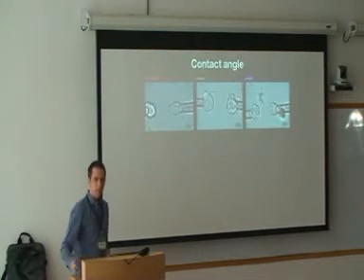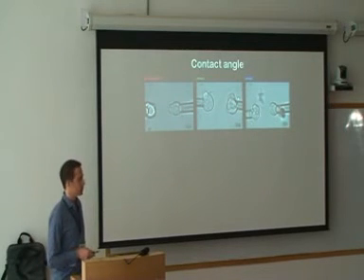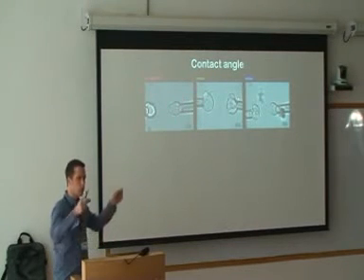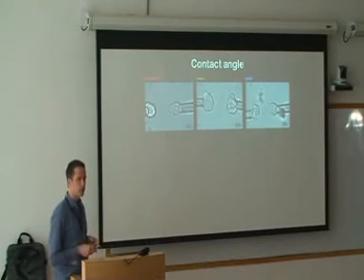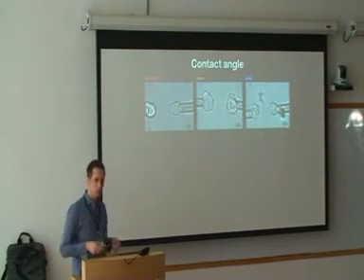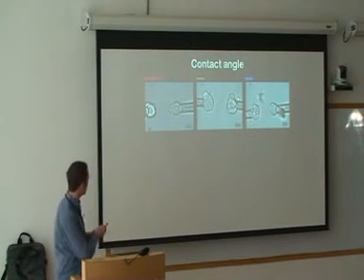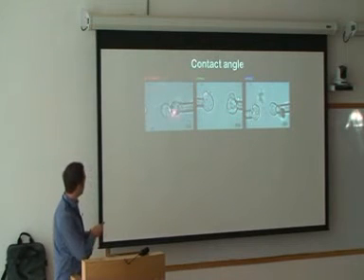Okay, so now here come the pipettes. If we look at doublets, you have to somehow create these doublets, and the way we do that is using micropipettes. These are glass pipettes, as you can see here and here, and they are connected by tubing to a pump, and the pump creates underpressure in these pipettes. So you have a sucking pressure, and you take these pipettes, which are on micromanipulator arms, and move them to the cells in your culture dish. You have to dissociate your primary progenitor cells, and then you pick cells up and move them together, as shown in this movie here, and then you can watch them.